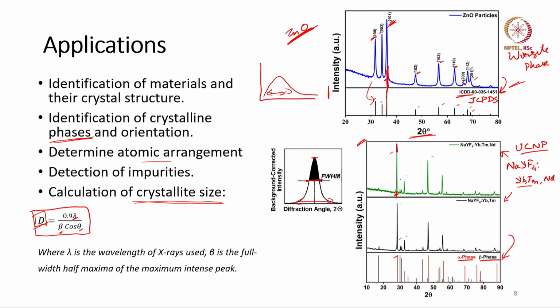If you go through a lot of literature, you will find terms like crystallinity, crystallite size or phase determination. So, everything I discussed here will be useful for you whenever you read a research paper in which a lot of characterization of that material has been done. So, these are really useful whenever you go through your literature survey.